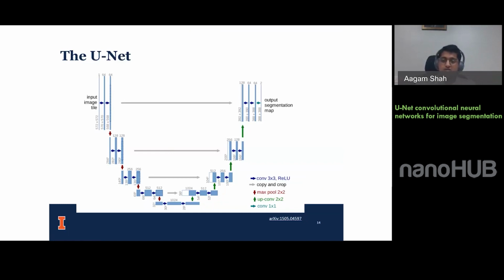In general, convolutional neural networks have proven themselves to be very useful for image processing. It allows us to not have to connect every single pixel to each other from the starting image. We can reduce the image to a much smaller size in this latent space, and then connect only those pixels.